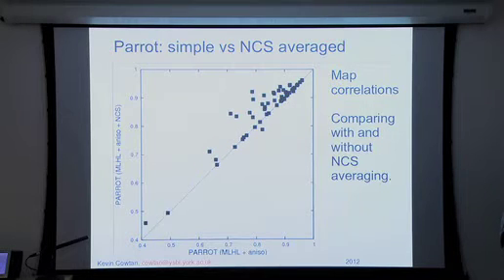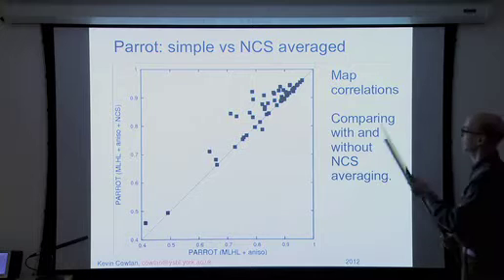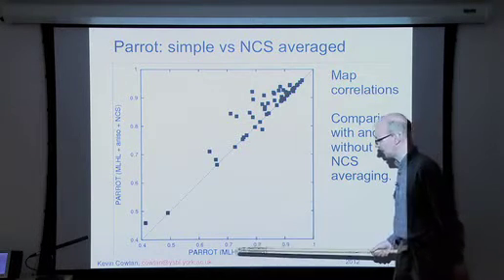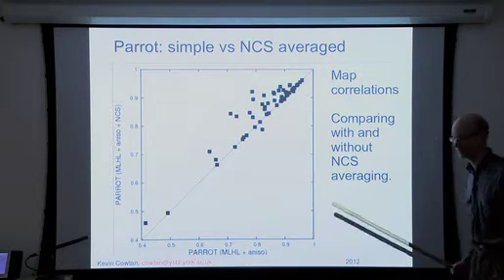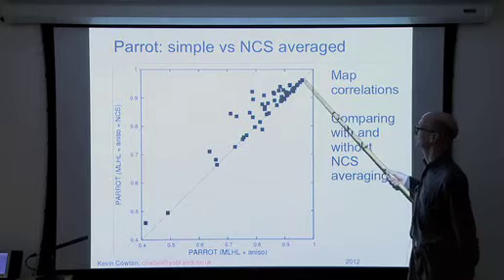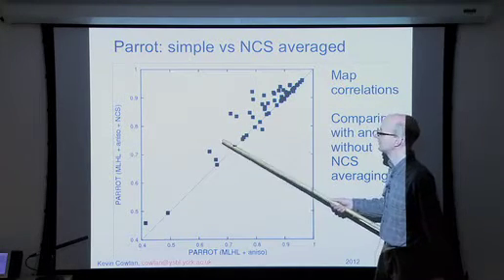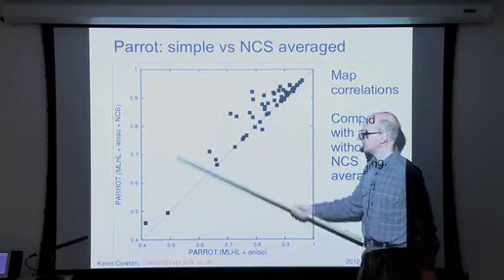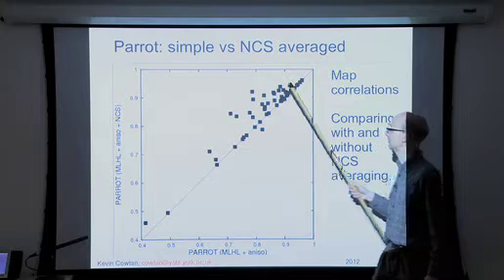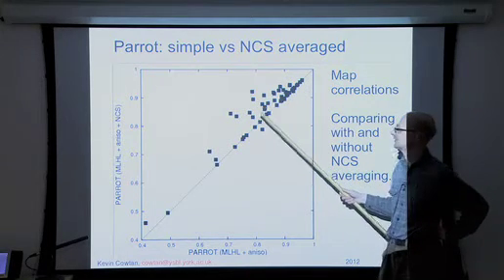That's of historical interest only. I'll just show you one quick example. This is 50-odd structures where I ran density modification with the latest methods, with and without non-crystallographic symmetry. And you can see some structures don't have any non-crystallographic symmetry, so it makes no difference. Where you do have it, then, this is agreement without NCS and with NCS, with one representing perfect. And so anything above the line, NCS has helped us.